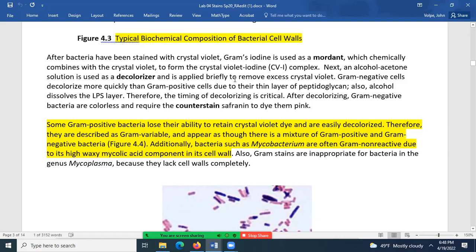And so that makes the crystal violet stain the cell a little more intensely, gives it a little browner color, meaning a little more purple color, and prevents it from washing out in the decolorizing step because it's a larger molecule. So it prevents it from washing out.